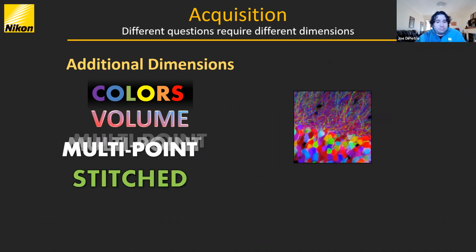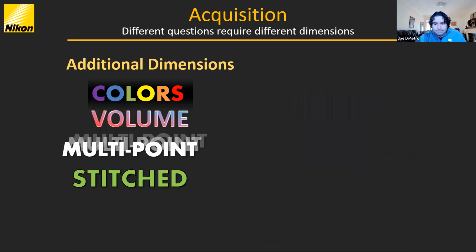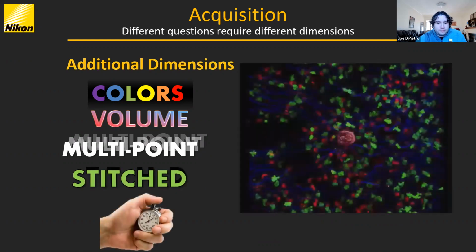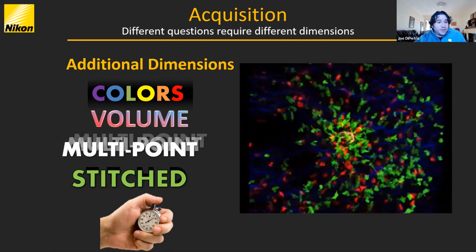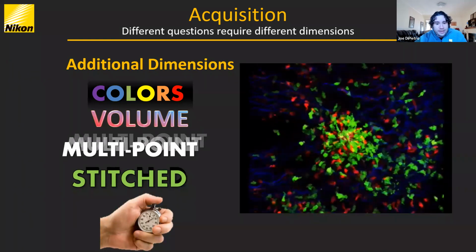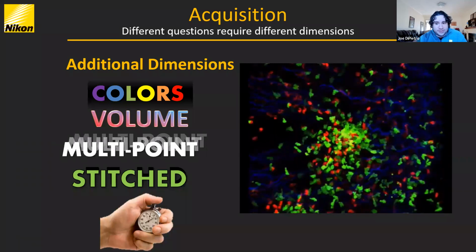Maybe you want to image your entire sample. We can stitch it together, right? And of course, we talked about this a little bit, taking images over time so that you can capture events that are dynamic and look at live samples and stuff like that.